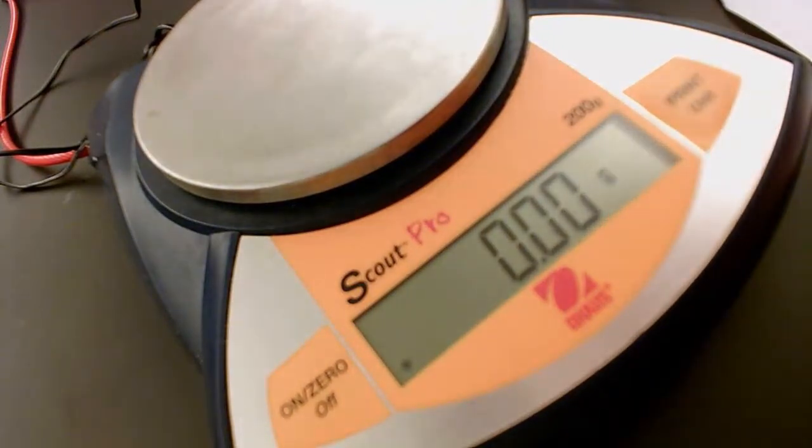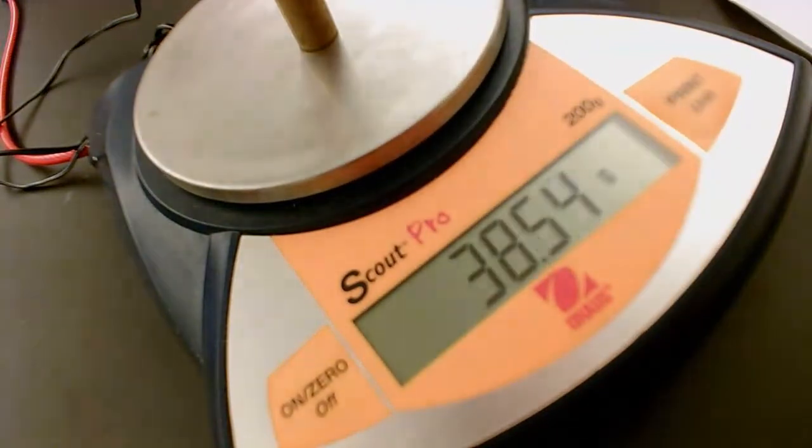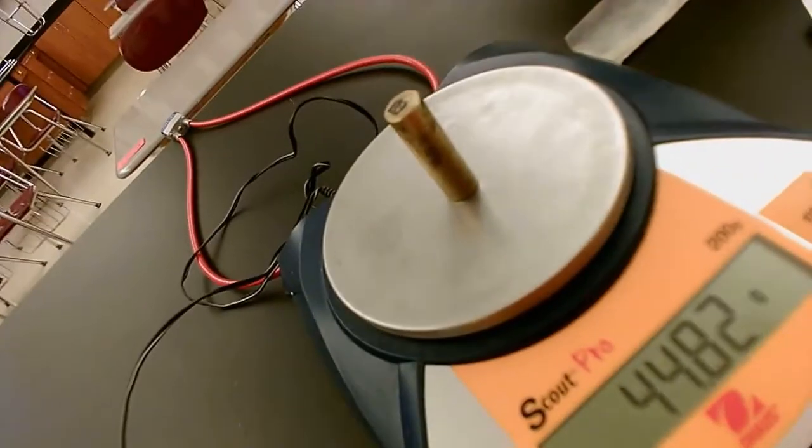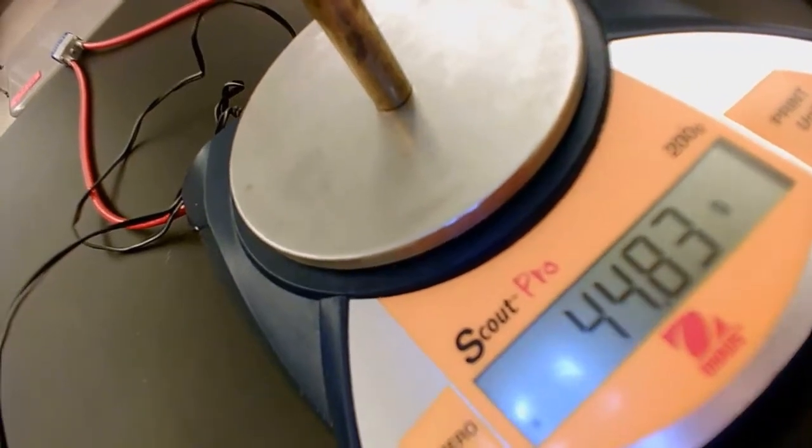This must be B. Oh, it's B. All right, so ready? Let's get the mass of B for those people that will be doing solid B. Again, right there's the decimal point. Wish I could focus this a little bit better.